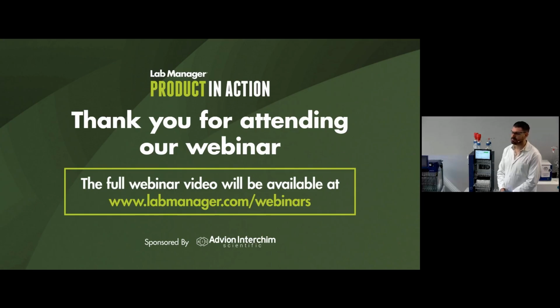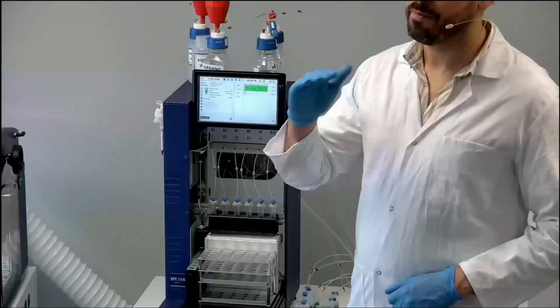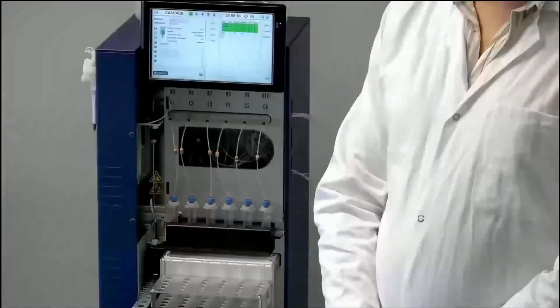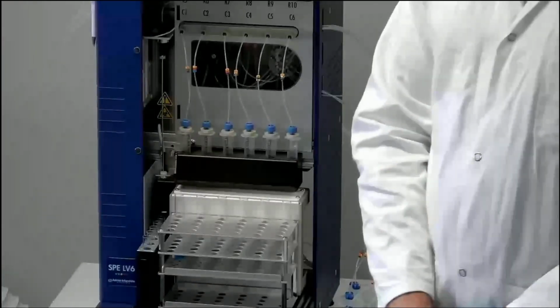And sorry, we have one more question, Benjamin. It says, do we have a pressure sensor? No, we don't have a pressure sensor. The only thing that you have inside the system is the syringe pump. For example, if you have too much pressure inside your columns, the syringe pump will automatically stop the method. Why? Because it's to avoid breaking your syringe pump due to the pressure. So it's a safety. We don't have a sensor, but we have specific electronic cards to control this.